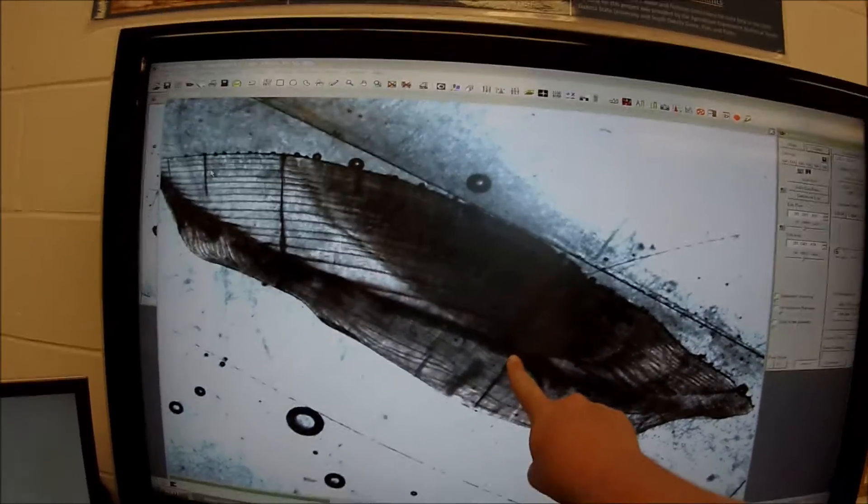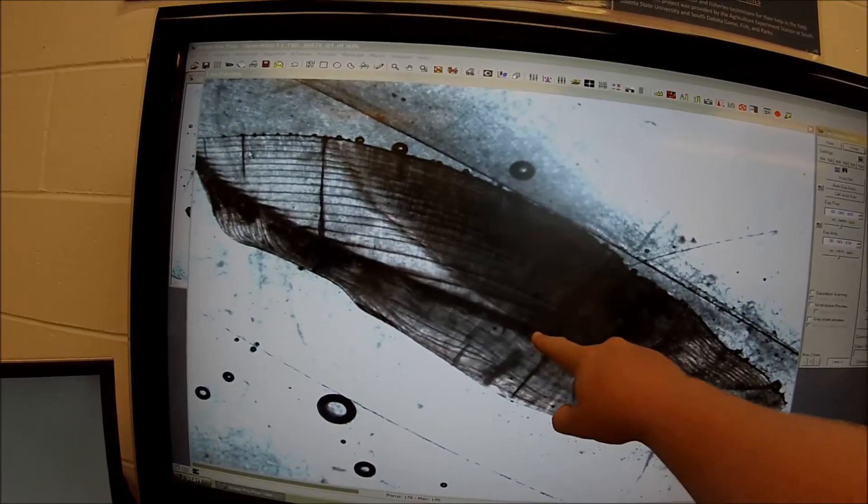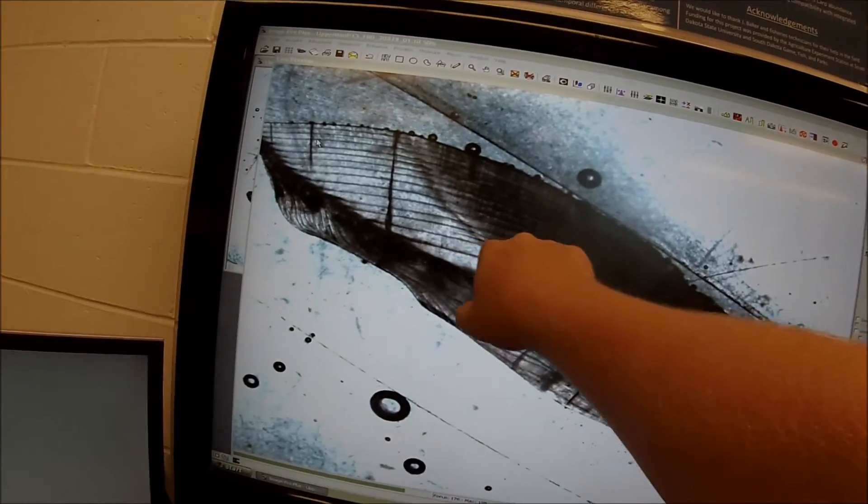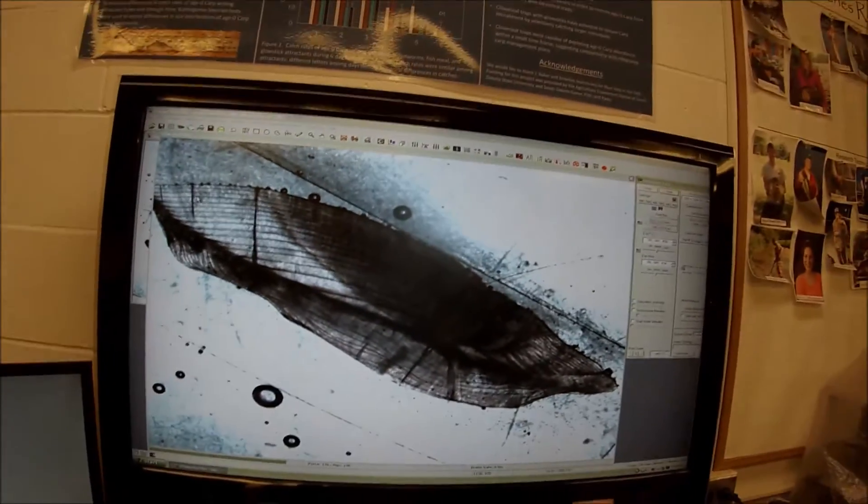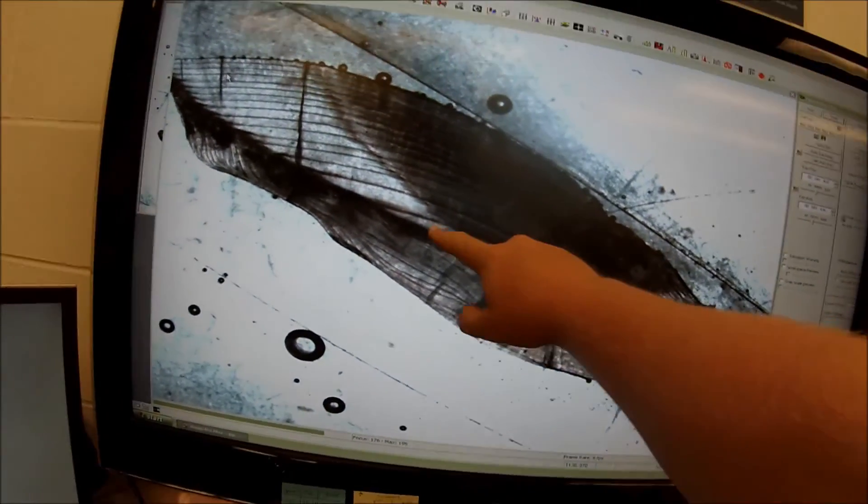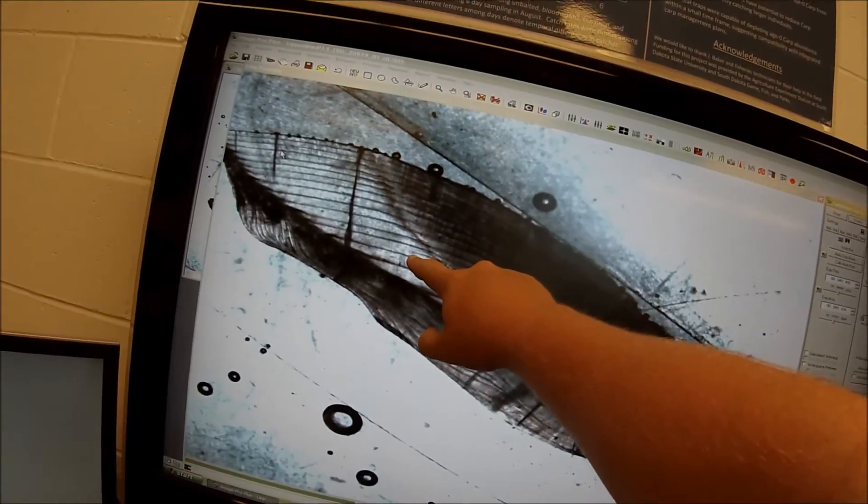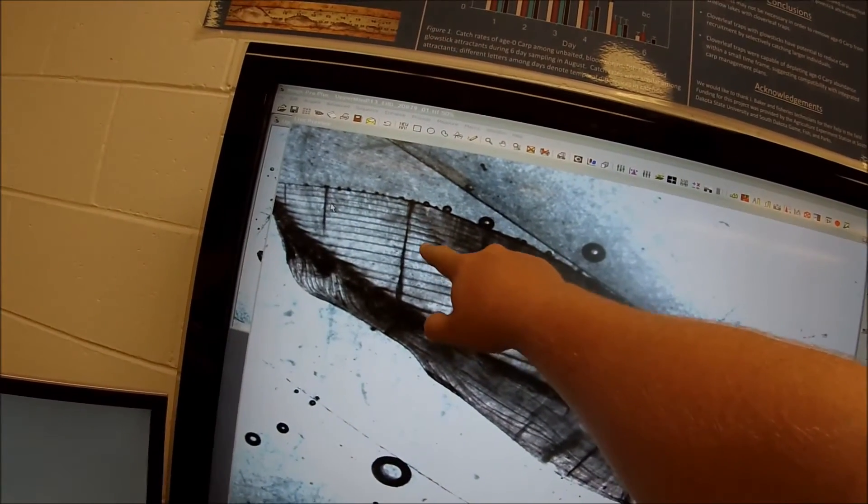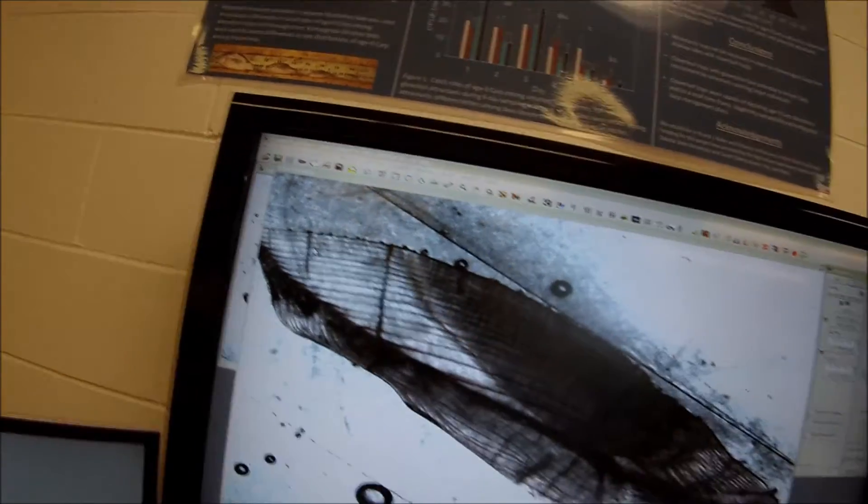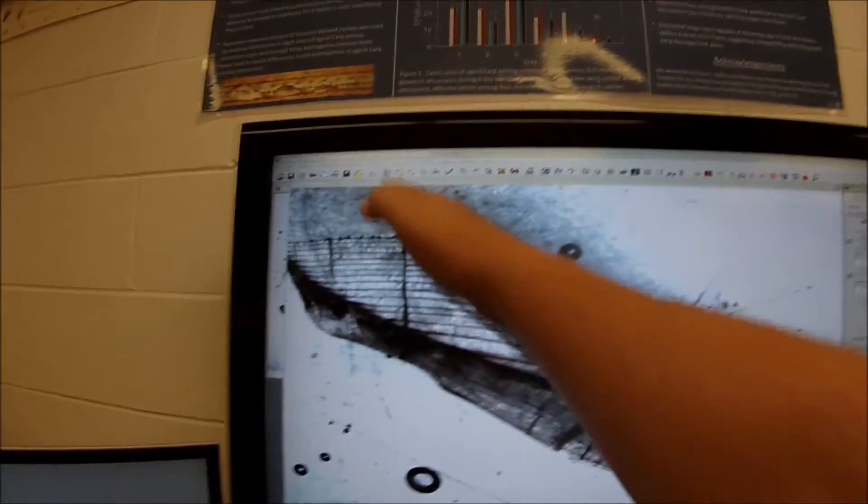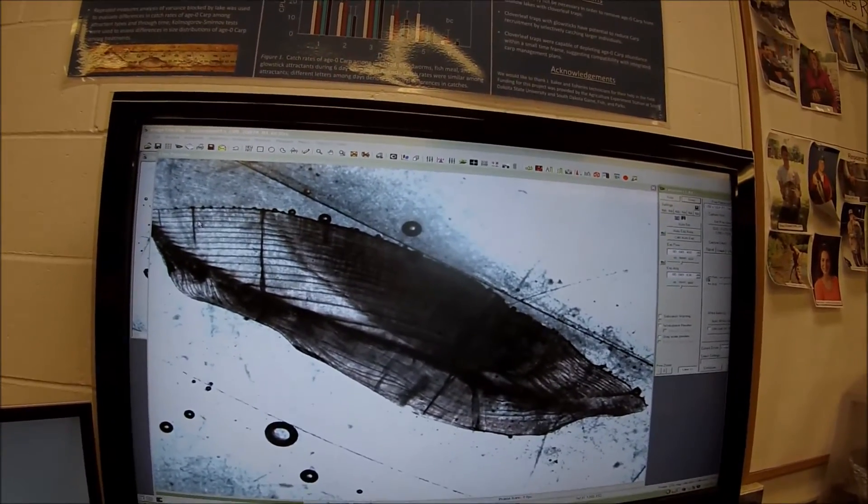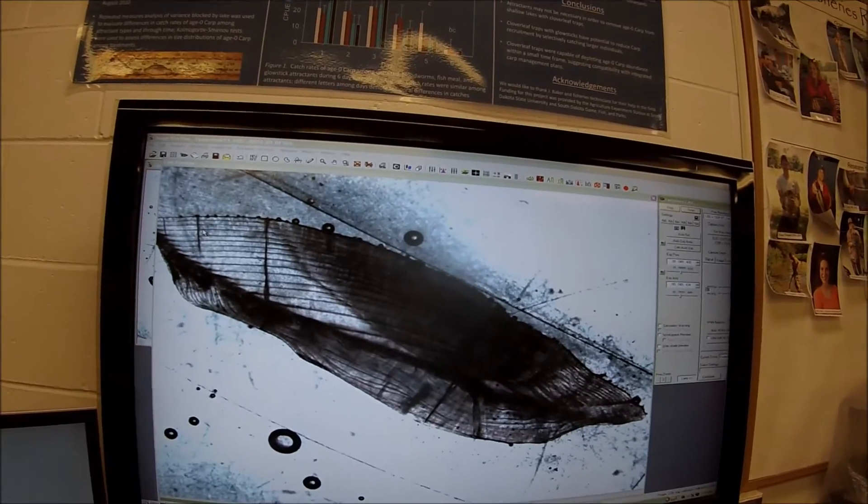This is the nucleus. This is what you call the center of the otolith. And then from here, you count the dark bands. Those are annuli, growth rings, just like a tree. So we have the nucleus. Then we've got 1, 2, 3, 4, 5, 6, 7, 8, 9, 10, 11, 12, 13, 14, 15, 16. Roughly 16 on that transect. That's an old, old freshwater drum. So pretty incredible.